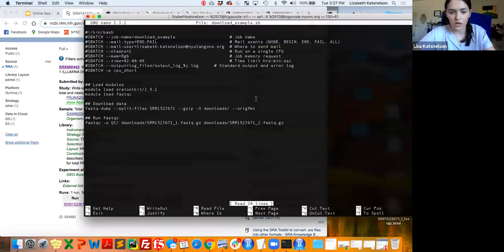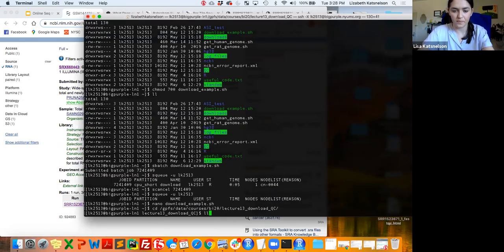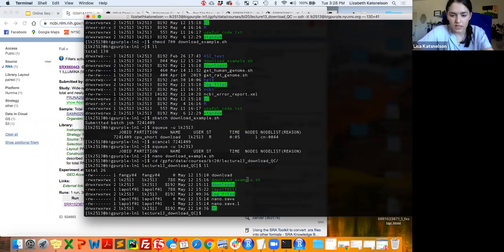Okay. So I already ran this before, so I'm not going to rerun it now. I did cancel my job. If I go back to our class folder, I can show you what the outputs look like. Data, courses. Okay. If you are doing stuff in the class directory, it will save here. So there's different stuff here now. Please, if you're going to change stuff, take it into your home directory. So hopefully everything stayed the same here.